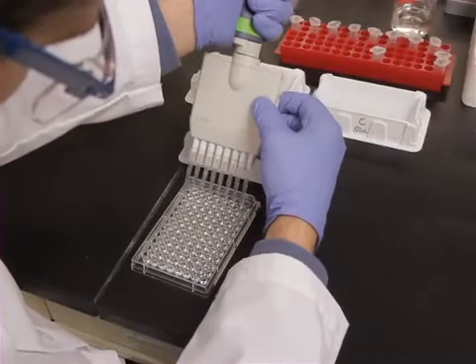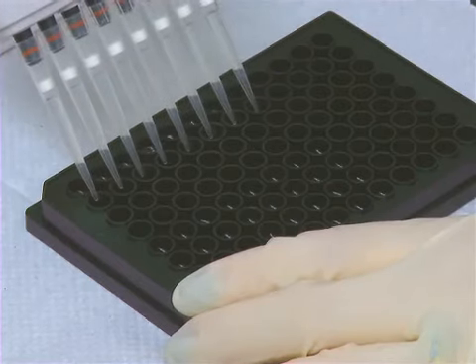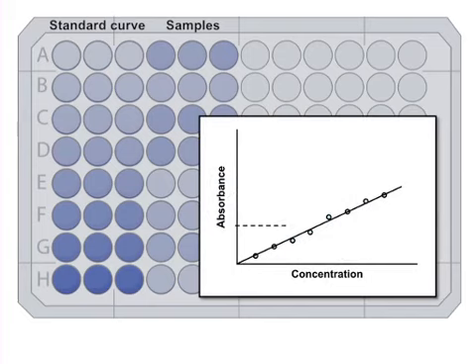The absorbance of the standard curve wells, which contain known concentrations of the target protein, will be used to calculate the concentration of target protein in your experimental sample wells, based on a comparison of the absorbance of the sample wells to the absorbance of the standard curve wells.